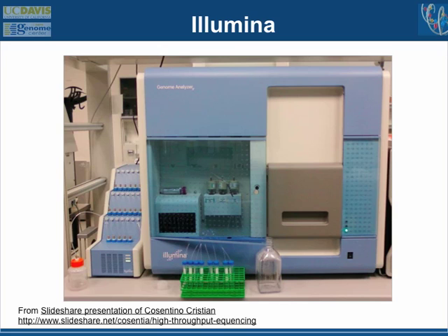There are a lot of other places that have developed pyrosequencing. There's a QIAGEN pyrosequencer now that some people are using for epigenomics to look at methylation status. And there, I think, are a couple of other companies that are now marketing pyrosequencing-based sequencing methods.